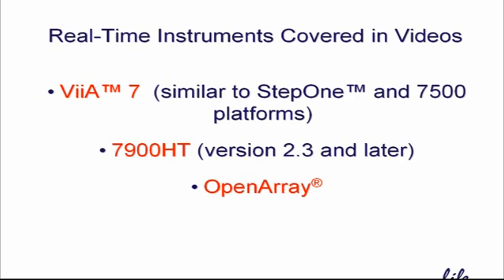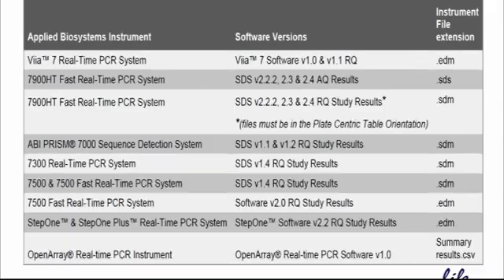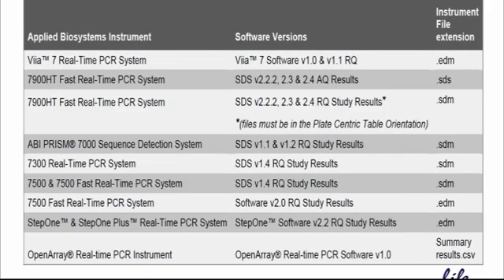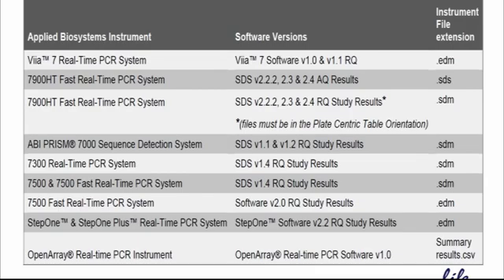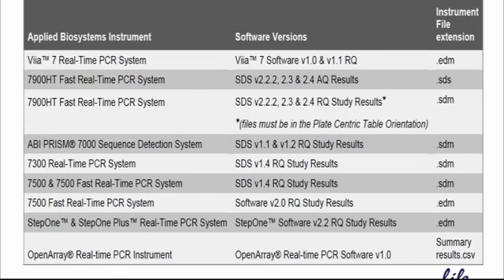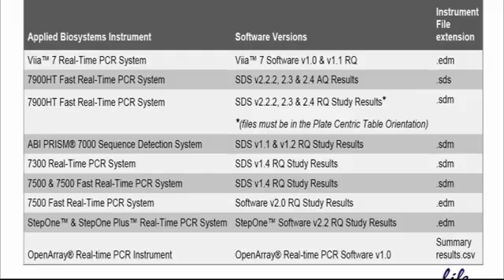Data Assist can accommodate multiple export file types, including the ones you see here. If the real-time software version you're working with appears on this list but isn't covered in this video, please consult your real-time user manual for directions on properly setting up a Delta Delta CT plate.